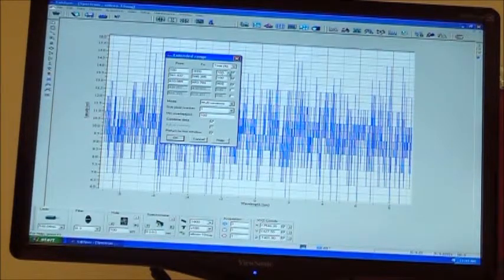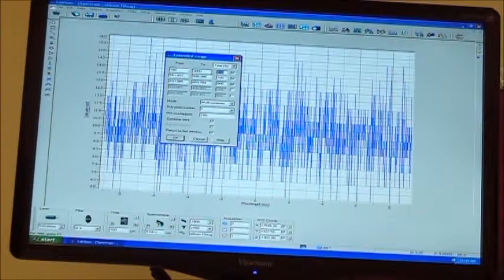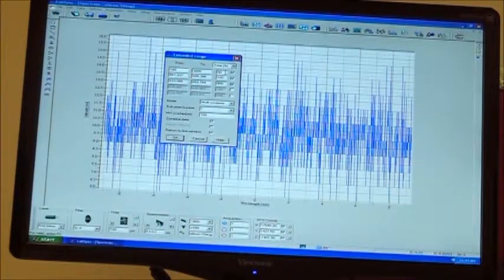Or the same thing, if you know the first window has really high data that oversaturates your system, you could set it for 50%. Then the first window will only acquire for 0.5 of a second. The second range you determine would acquire at 100%, which would be 1 second, the time we got. And the third one would be 900%, or 9 seconds. Okay. So you can have different acquisition times in different areas of your spectrum. I'm just going to set all these back to 100 so people aren't confused.